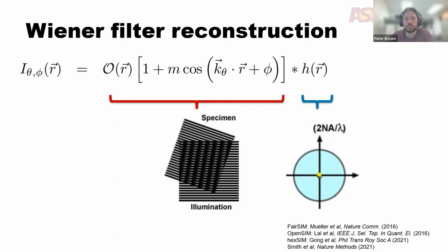This is a relatively simple algorithm that has some known limitations, but some of the primary benefits include the fact that it's a linear reconstruction approach and therefore relatively easy to understand what's going on, easy to understand where artifacts may come from or other issues may arise, and so therefore easy to diagnose these and correct them. But of course, there are other more sophisticated algorithms that use, for example, Bayesian approaches or more optimization-based approaches that can also be very interesting and useful.